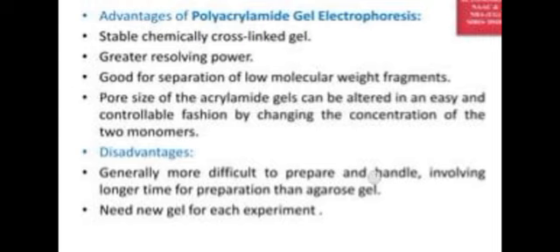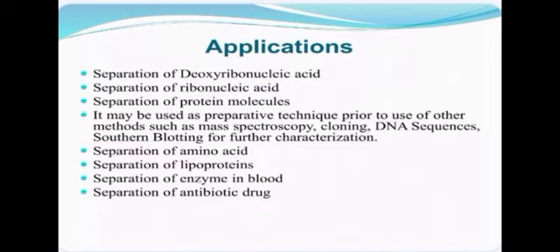Next we see the applications involving gel electrophoresis. Gel electrophoresis is used to separate the deoxyribonucleic acid. Second one, separation of ribonucleic acid. Third, separations of protein molecules. Fifth, it may be used as preparative techniques prior to use of other methods such as mass spectroscopy, cloning, DNA sequencing, Southern blotting for further characterization.